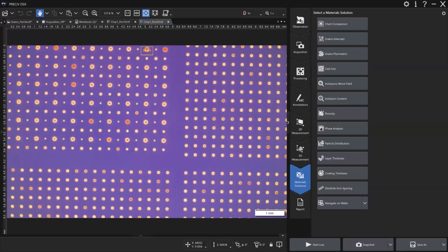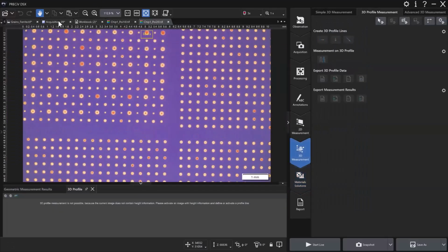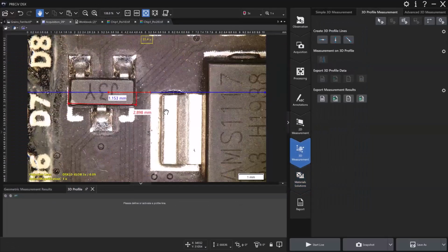Okay. And I think you mentioned this earlier, Z measurements, but can you go over the Z measurement capabilities? Absolutely. So yeah, 3D measurements. I'll go back to my 3D image here. Since we capture something with a motorized or encoded focus, it has to have that to capture the height data as it builds the all-in-focus image. We call it extended focal imaging.